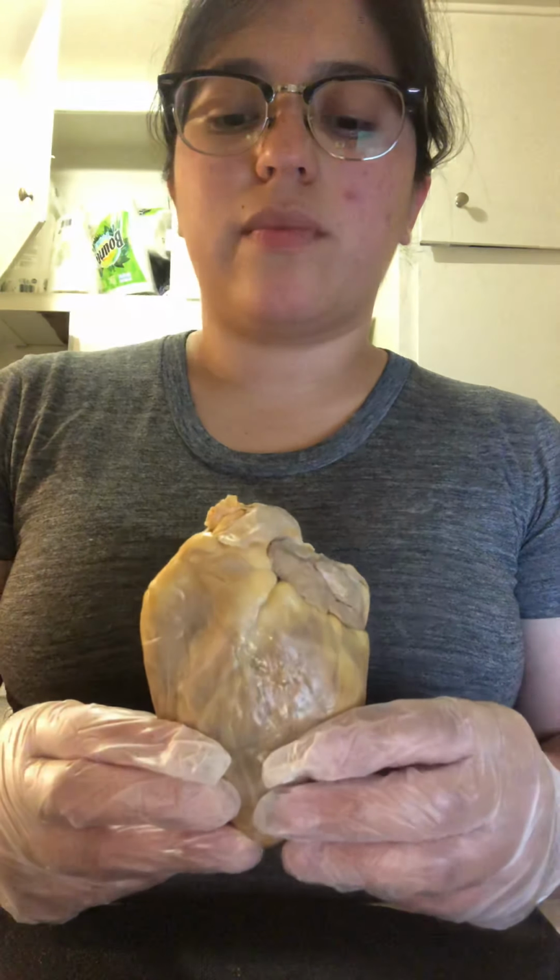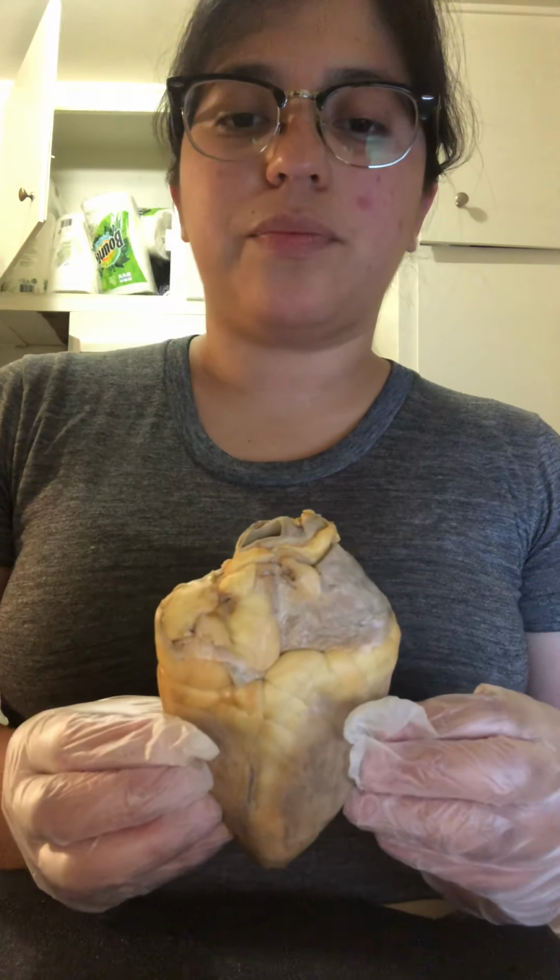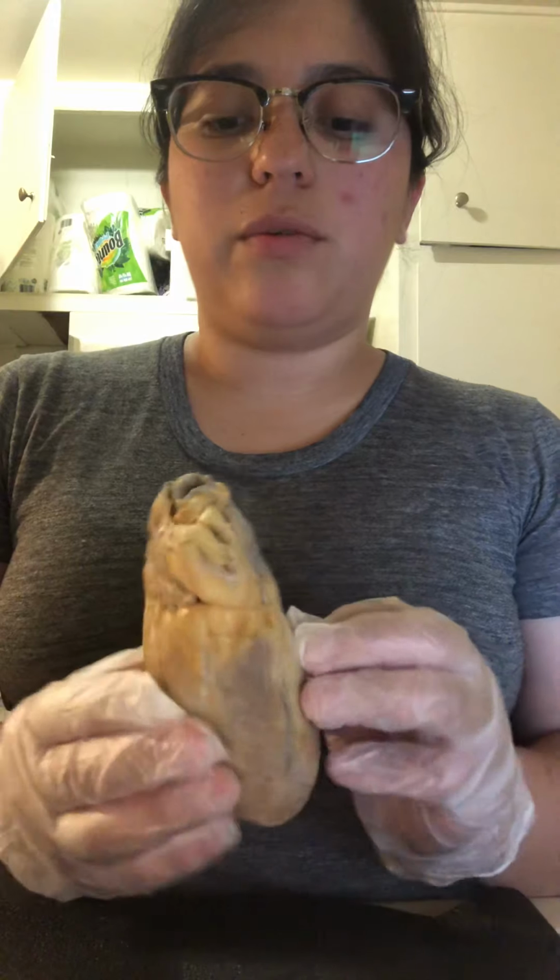So I'm going to start off by identifying the anterior view of the sheep's heart. So this is the anterior view. This would be the posterior view, and this would be the external dissection.